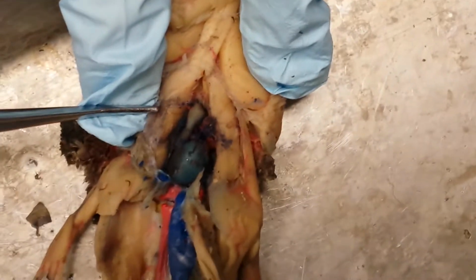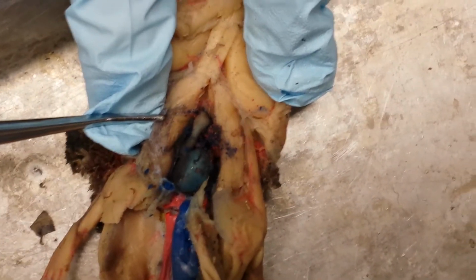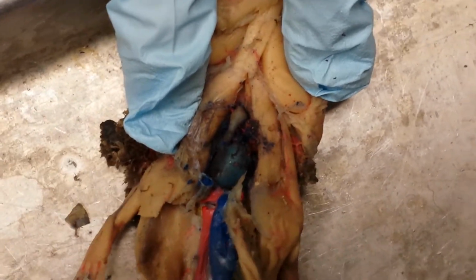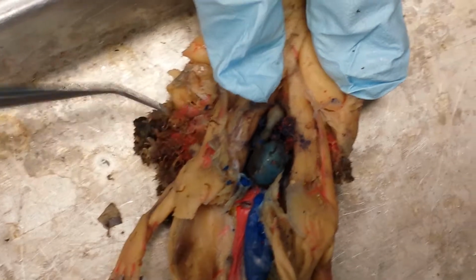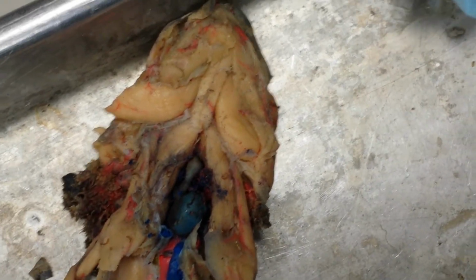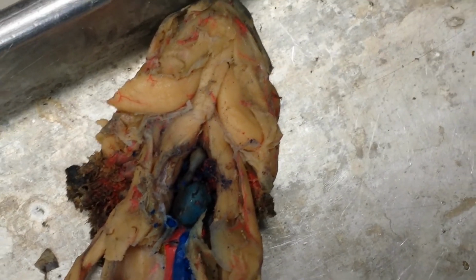Okay? So does the oxygenated and deoxygenated blood kind of mix together? They kind of mix together, but it's not deleterious for the animal because it has 2 ways of oxygenating blood, and though they're in the same chamber, oxygenated and deoxygenated blood, they don't mix very much. So it's inefficient, but again, the salamander has 2 ways of oxygenating blood and all that stuff. So that's it.